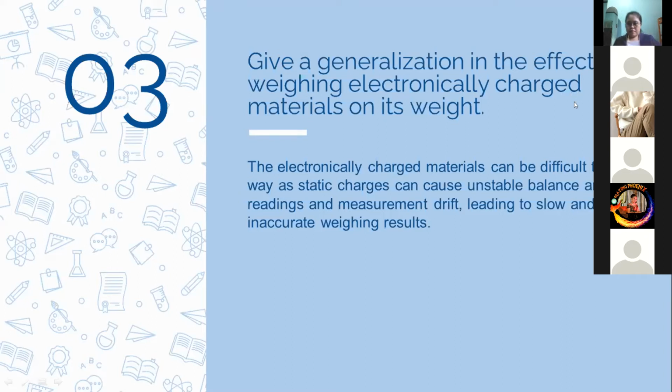So therefore, the charges affect the weight, which decreases the sample weight.